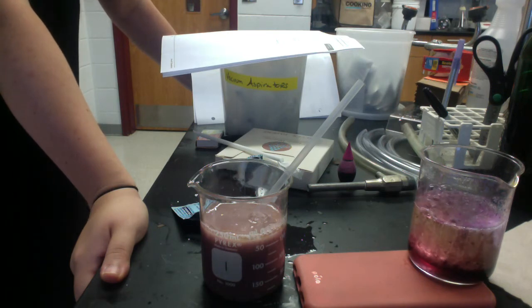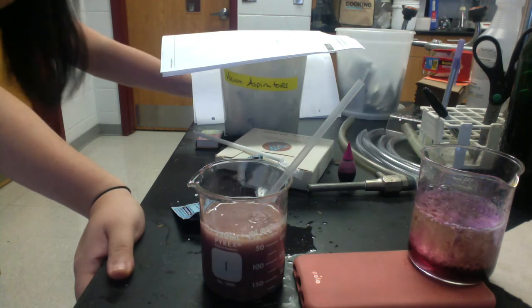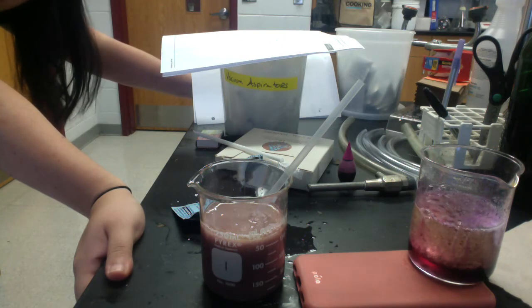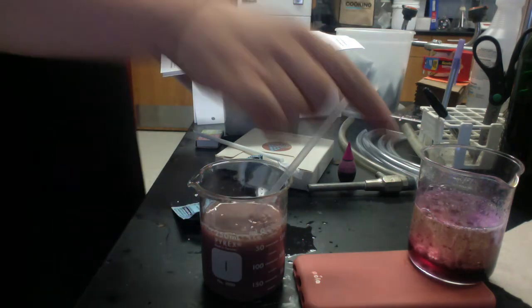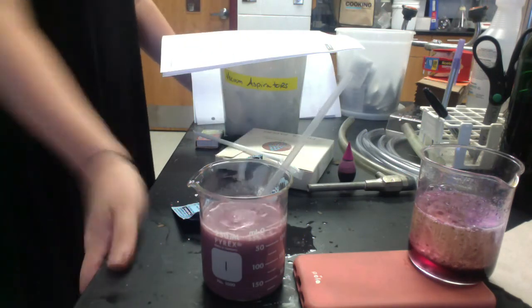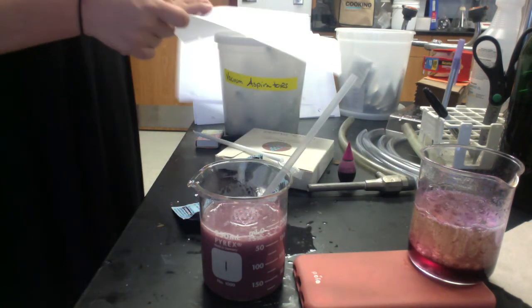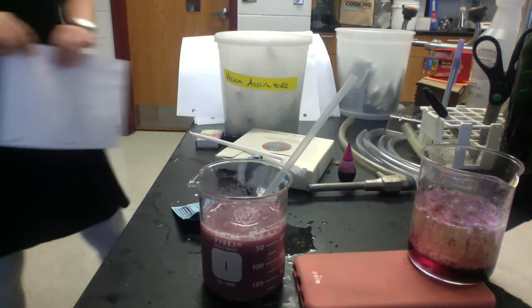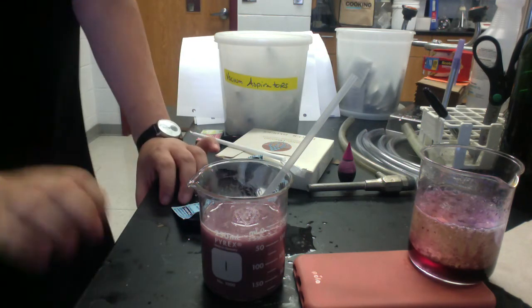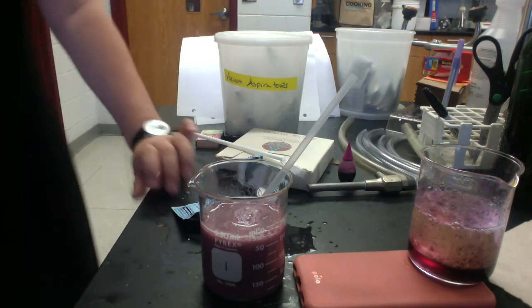What do you see? Why do you see what you see? What is going on with the particles that leads to all of this business that's here and here? This yucky goo mess. All right. And once that is done, we are done with lab 2.11. I'll let this bubble out, and we'll be good.